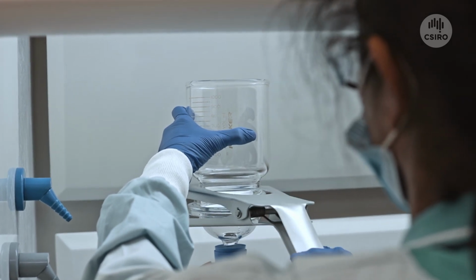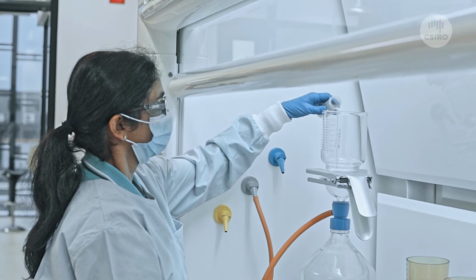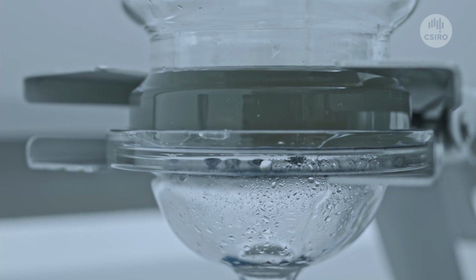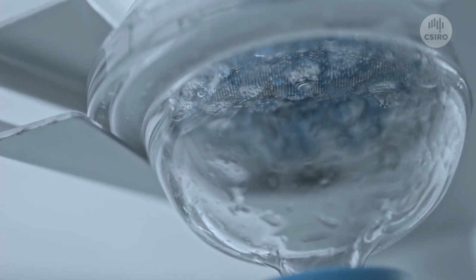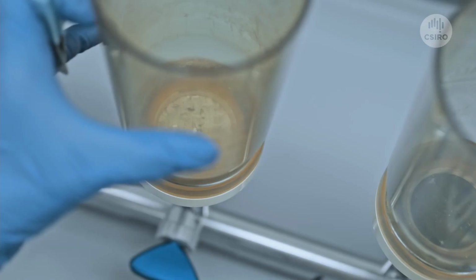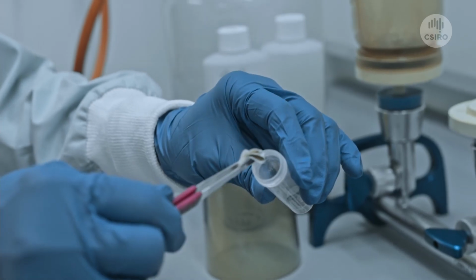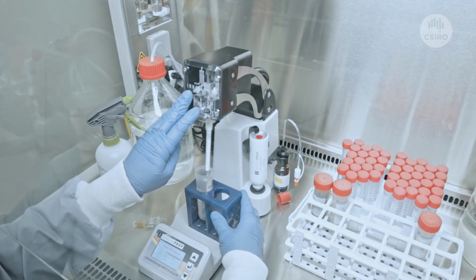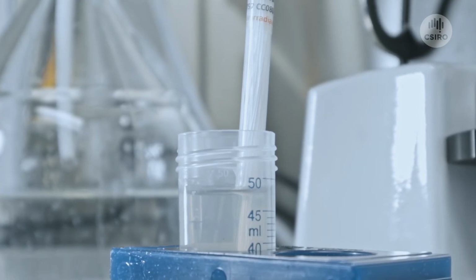SARS-CoV-2 is typically dilute in wastewater, considering the small number of cases in Queensland. So detecting this virus requires a concentration step. This step is very crucial for trace detections. We have refined several virus concentration methods to achieve the best results. We use these methods based on the sample type, volume, sensitivity required, and urgency of test results.